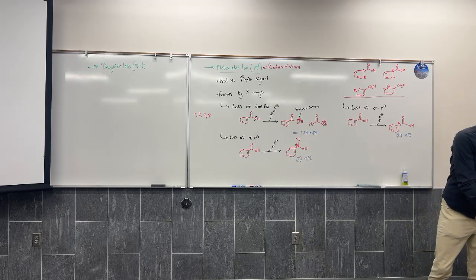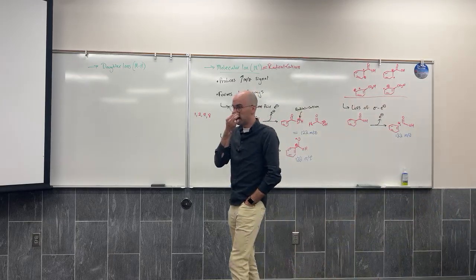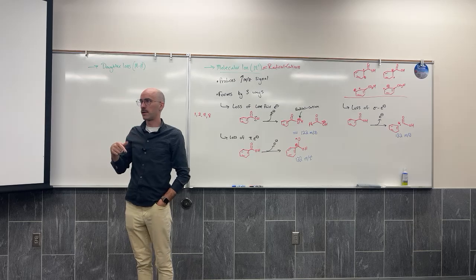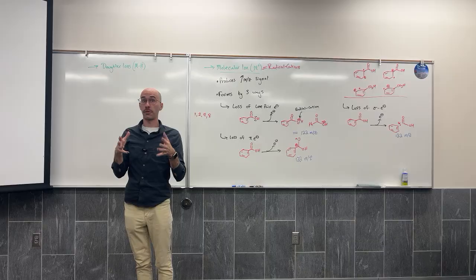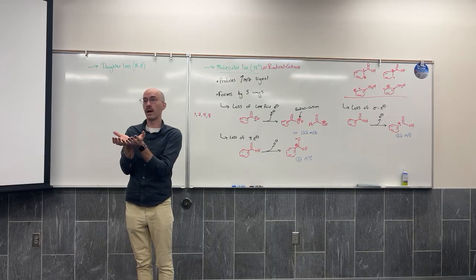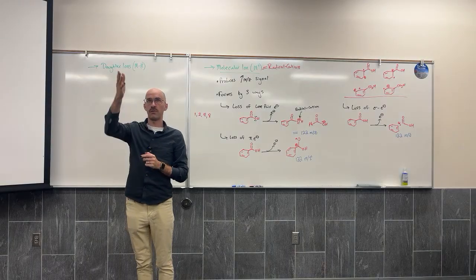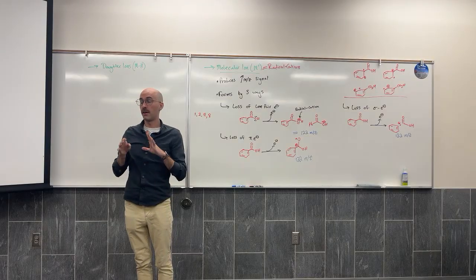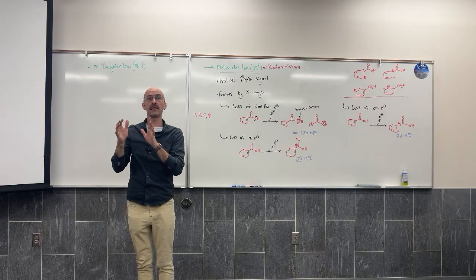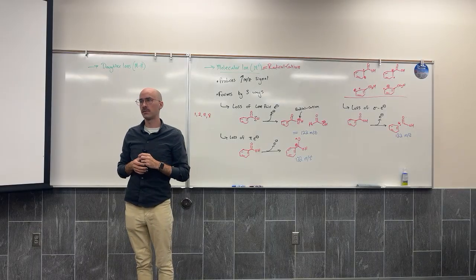Well, you'll notice on the correlation table that a lot of common fragments are listed. And we'll talk about common masses, like a methyl group. Carbon of 12 and 3 hydrogens. A methyl group weighs 15. Now every time you've got a methyl group, 15, 30, 45, 60, just like the clock. A CH2 group weighs 14. A CH group weighs 13. An OH group weighs 17. So there are some common mass fragments that you can just get used to.